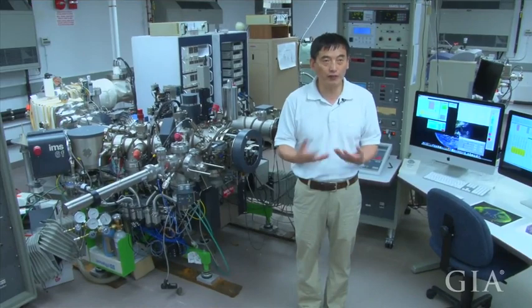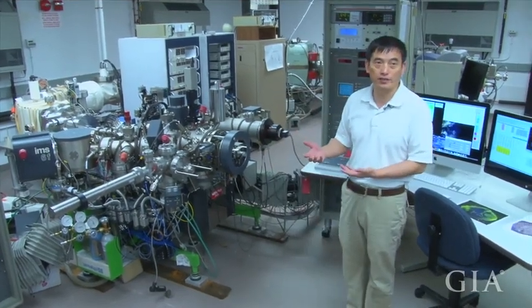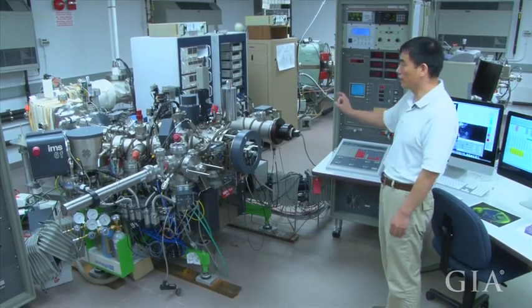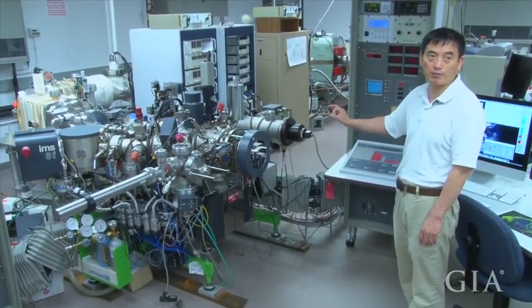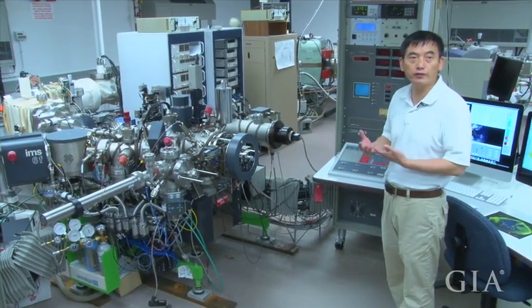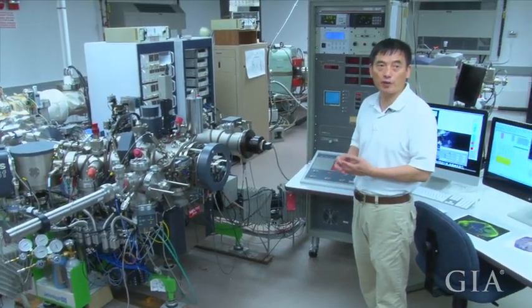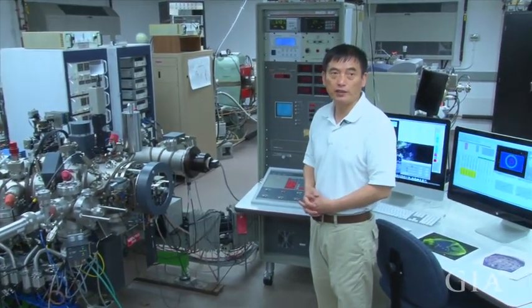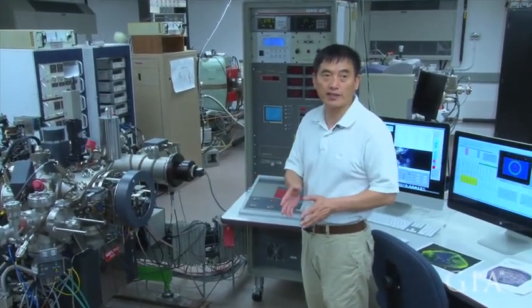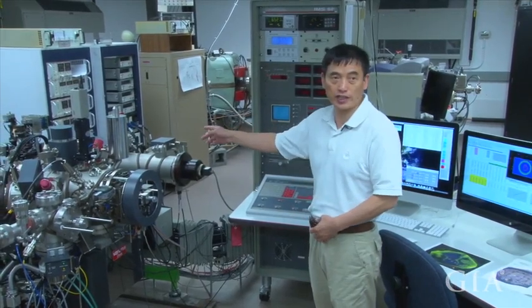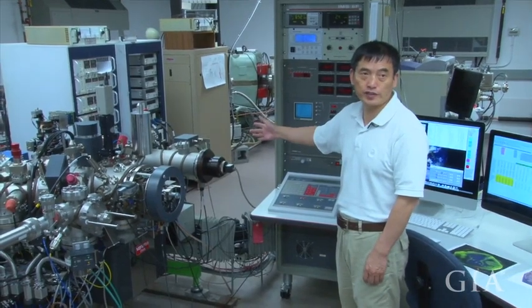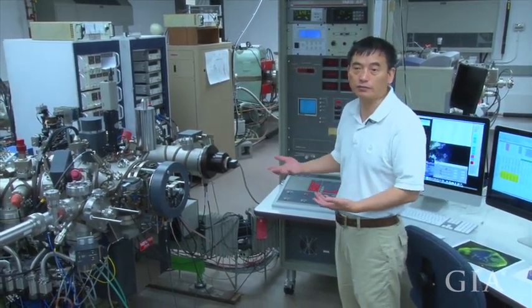We have different modes of detecting ions. One mode shows what ions are coming from the sample using an image, and another mode measures different isotopes coming from that spot. We do a scanning of different masses using the mass spectrometer, changing the magnetic field and detecting isotopes at different masses.